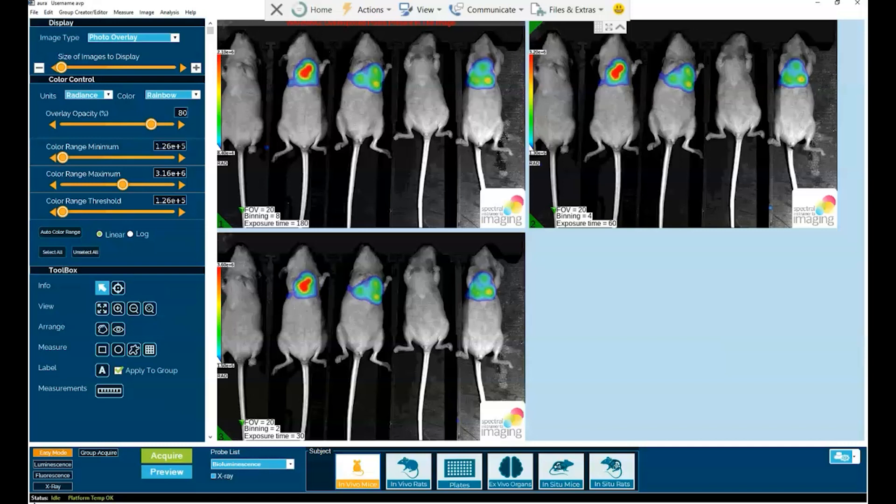Smart auto exposure, which automates the acquisition process within easy mode and is smart in that it can make use of an expanded dynamic range should there be both faint and strong signals within the animal target.